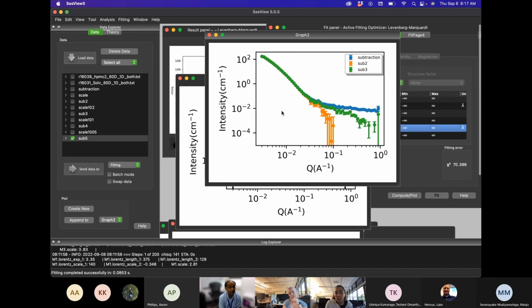As you go to really high Q, that's closer to 10 power 0, basically you have only background, usually. It's very rare, even if a polymer is there, for the scattering signal from a polymer chain to overpower the incoherent scattering from hydrogens, unless you have played with your system so well that you have almost no hydrogens. Or you have loaded your sample a lot with polymer, and it's very little solvent. But the polymer has hydrogens again. It doesn't matter where the hydrogen is coming from. You do have it, right? That's why really high Q should be a background.